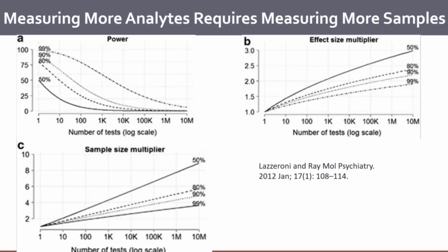One of the things that people start to cringe at is that the statisticians we often work with, including Olga at times, whenever you say you're going to be measuring 30,000 peptides, they're like, oh my gosh, you're measuring 30,000 peptides? What are we going to do with the multiple hypothesis testing? You don't have enough replicates in any of your conditions.